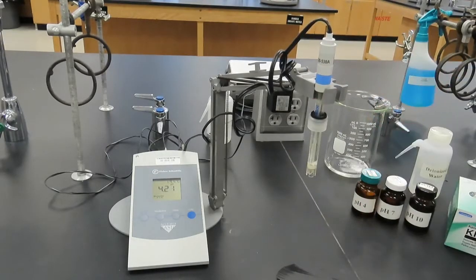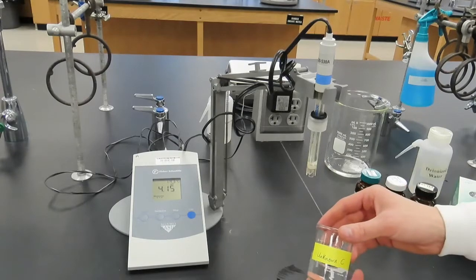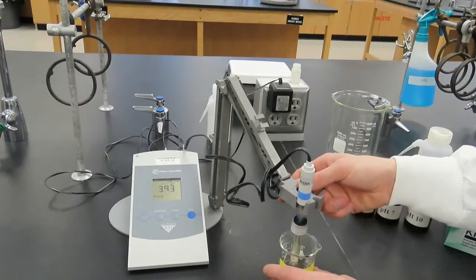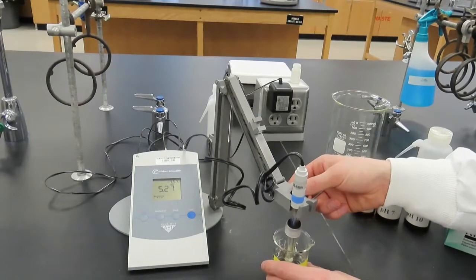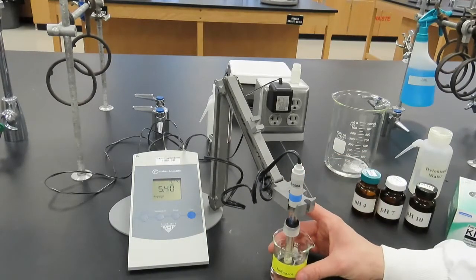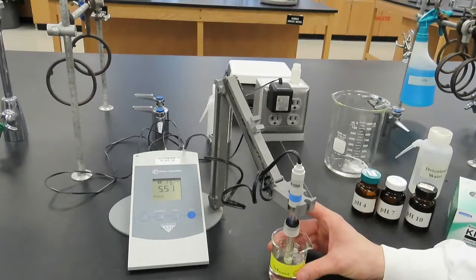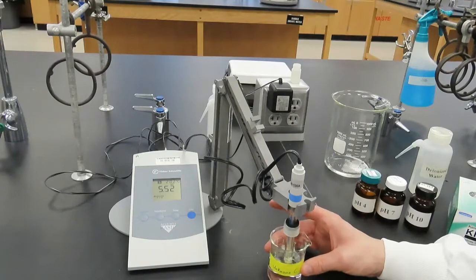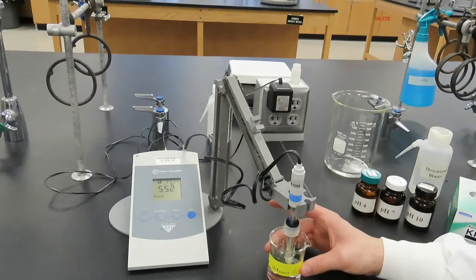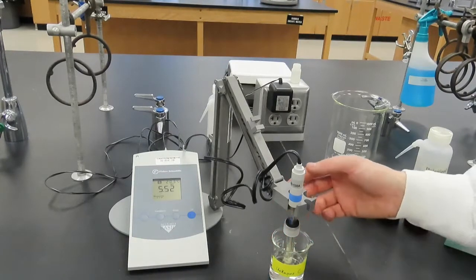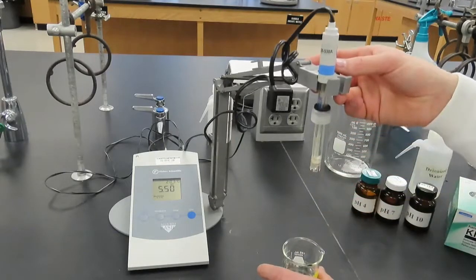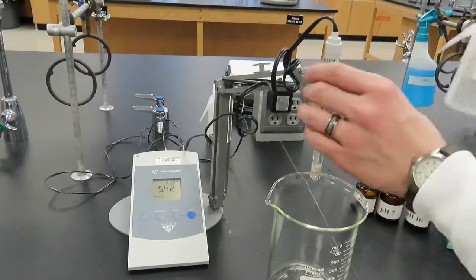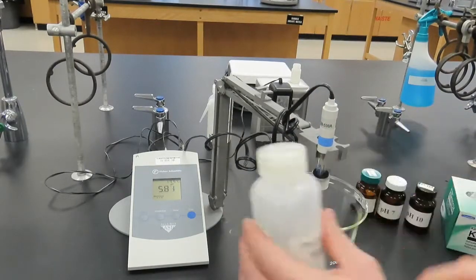We will now measure the pH of a solution labeled unknown C. We will immerse the pH electrode into this solution and swirl. The pH value when the display stabilizes is the pH of this solution, approximately 5.52. We will remove the electrode from the unknown C solution, rinse and dry it.